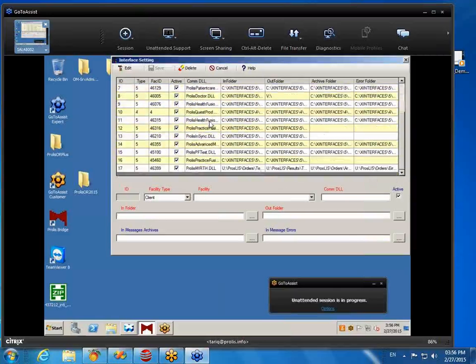Then just take us into one clinic. I just want to see how it works. No, I'm not going to go to a clinic. My question is a little bit different. Practice Fusion is an EMR used by the doctor. So if you look at the process, it's not a scalable one, right? You have to collect all the information from the EMR, and then you bring it back and enter it into the LIS system, right?